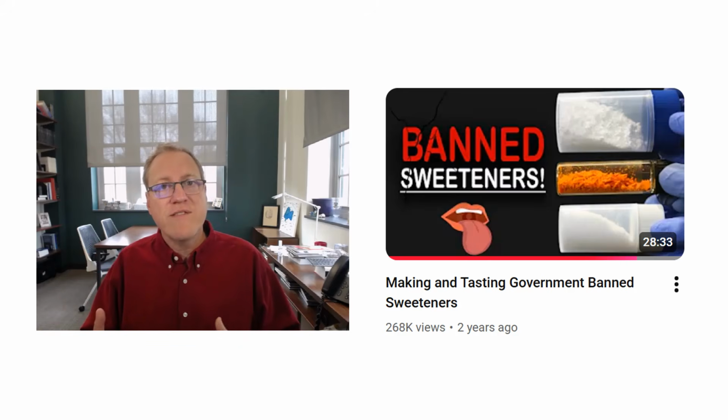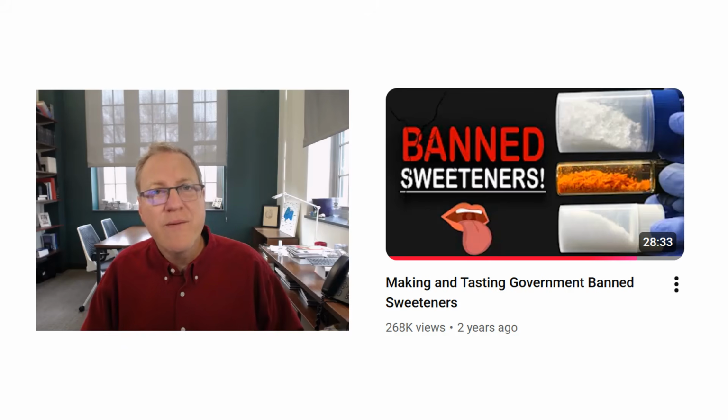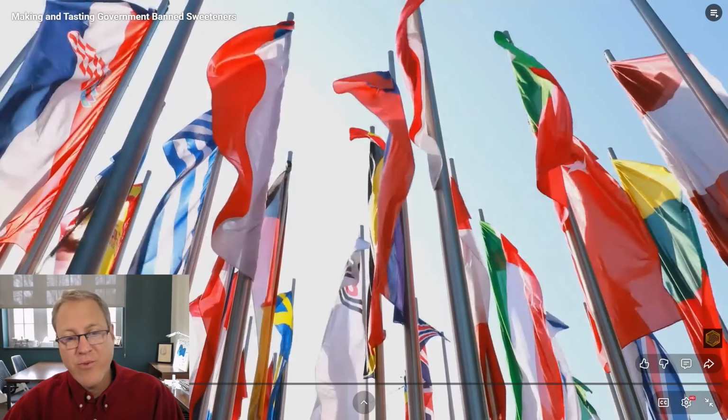And we're going to cover the synthesis of 5-nitro-2-propoxyaniline. And that's going to be about half of that 28-minute video. So let's go ahead and jump into this nice synthesis. All right, here we go.